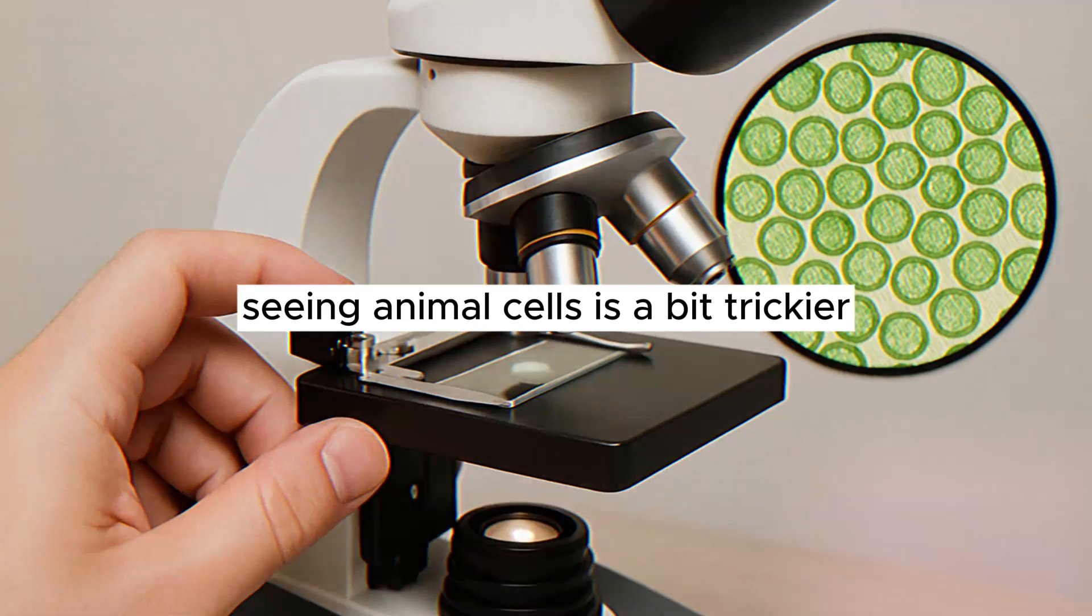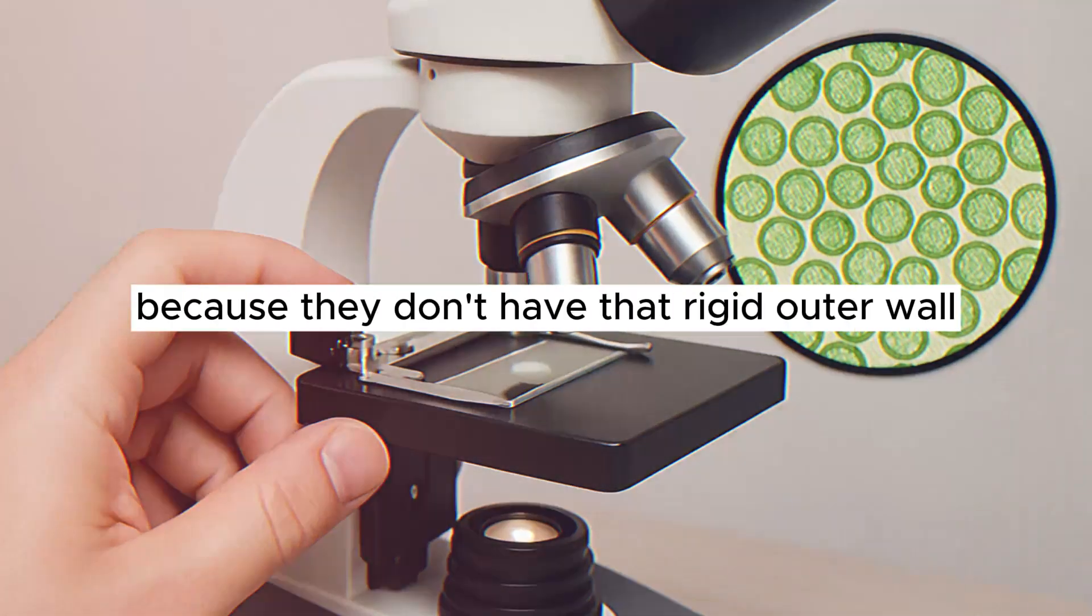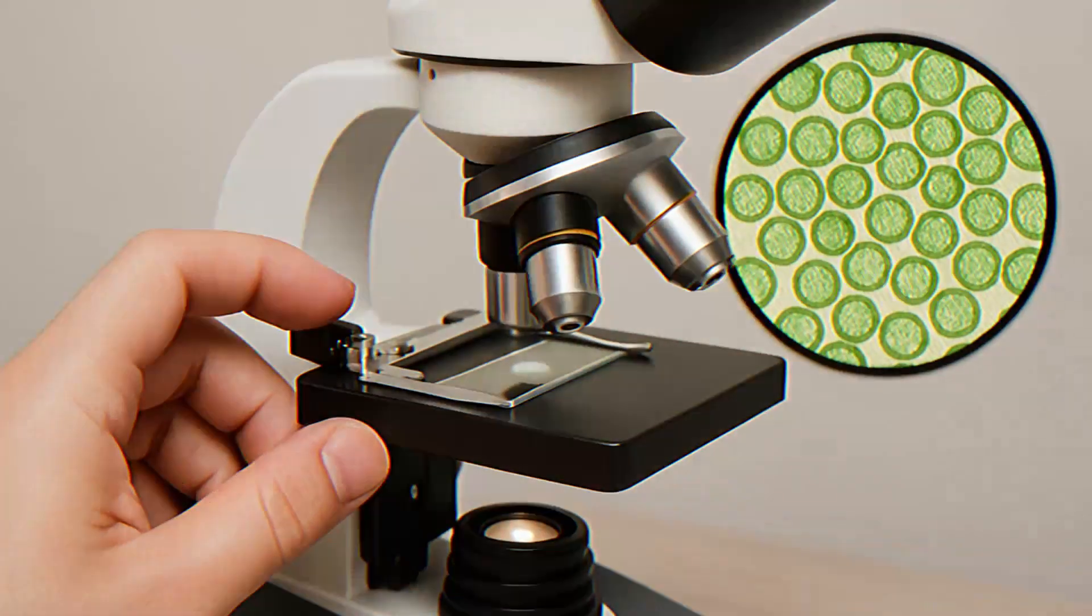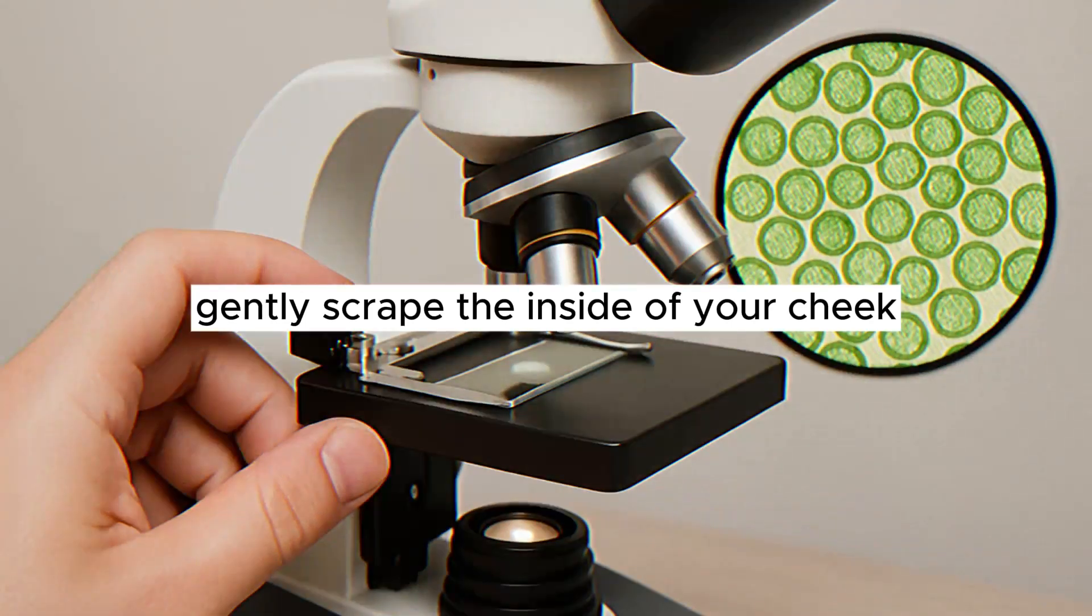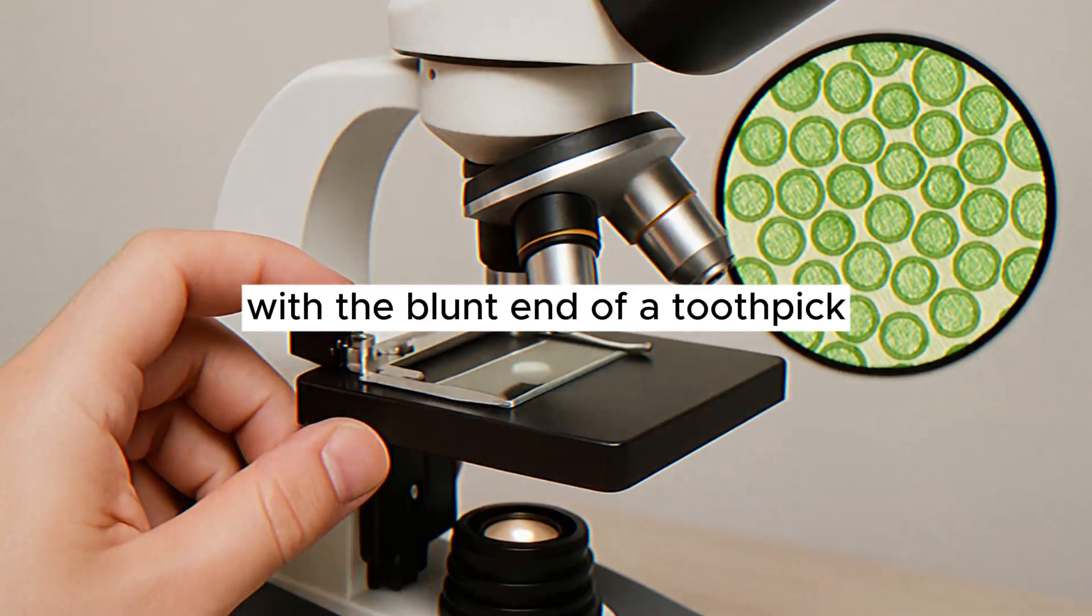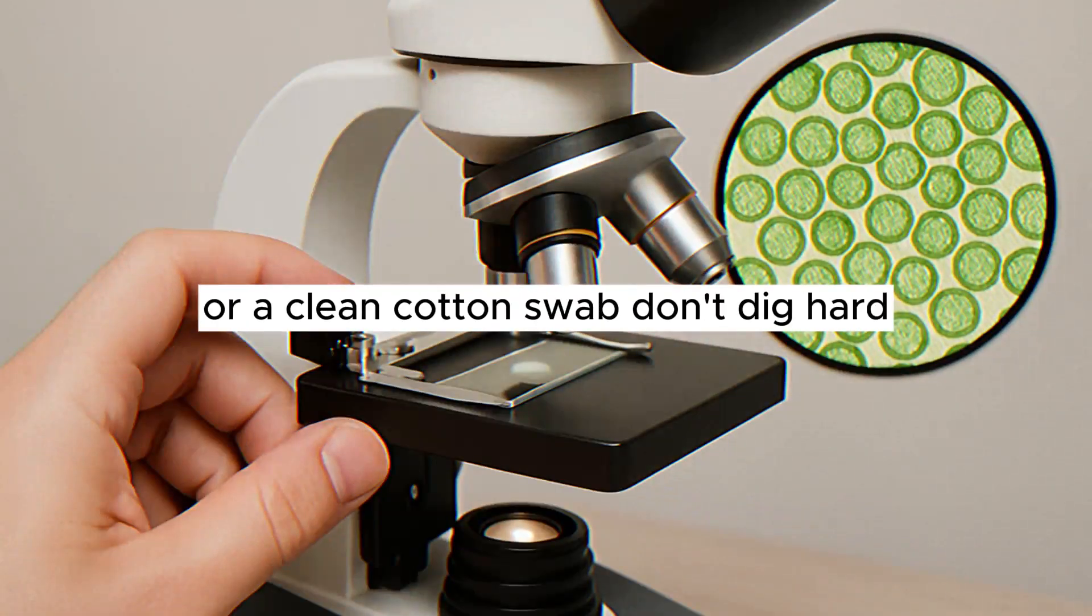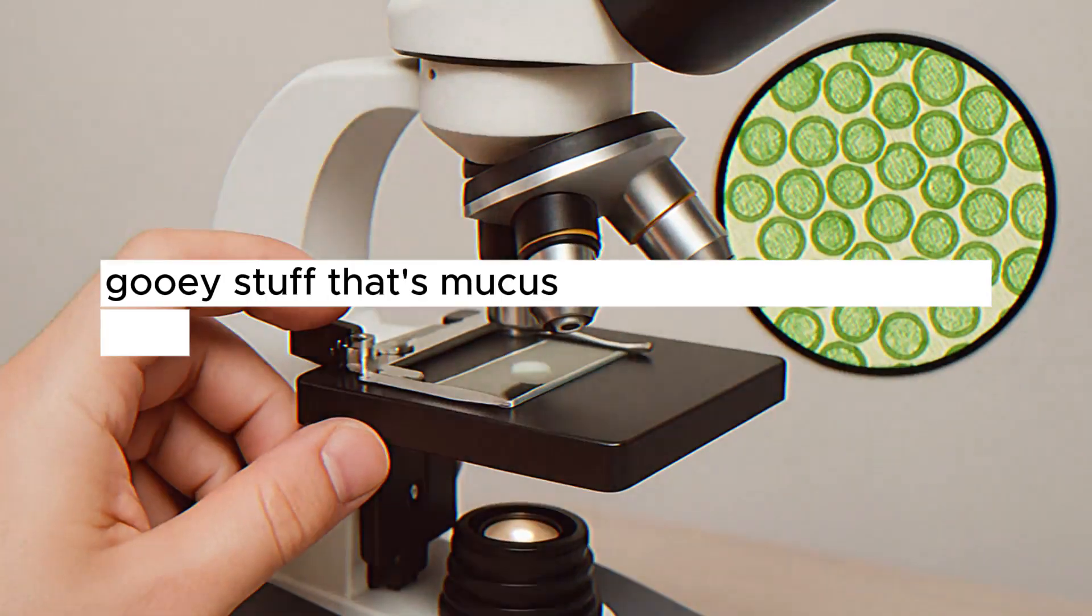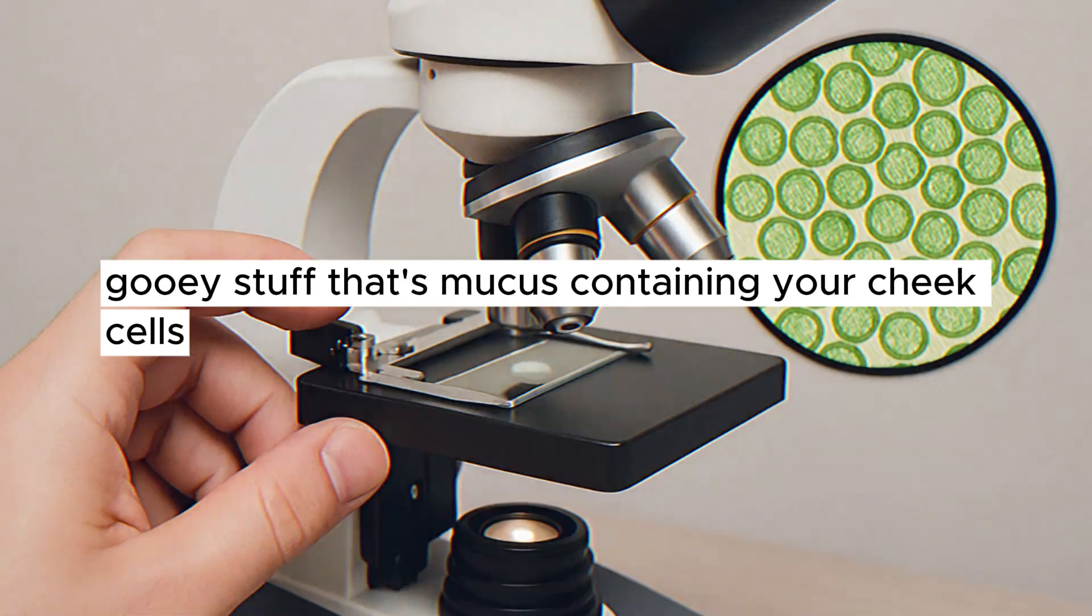Seeing animal cells is a bit trickier because they don't have that rigid outer wall. A common first animal cell to observe is your own. Cheek cells are surprisingly easy to get. Gently scrape the inside of your cheek with the blunt end of a toothpick or a clean cotton swab. Don't dig hard, just a light scrape.